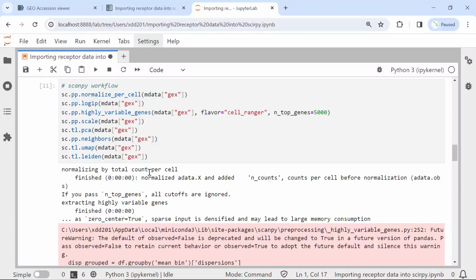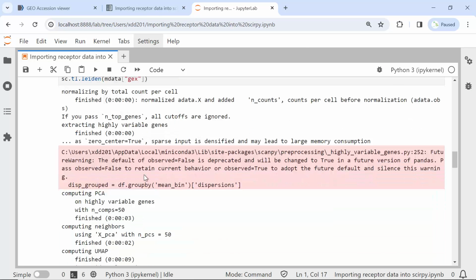In the original paper, they analyzed all the data, and they said in R, it requires at least 113 GB of computer memory. So my computer will not be able to do that. That's the reason we only downloaded one dataset for the demonstration.